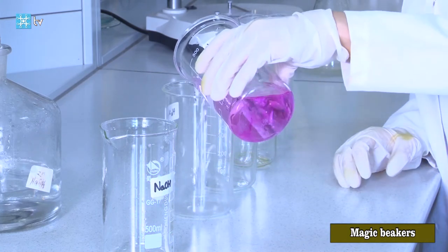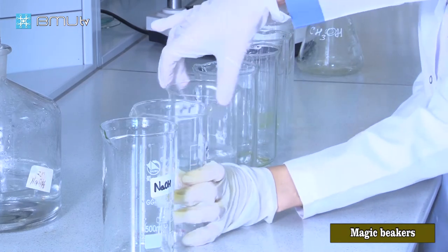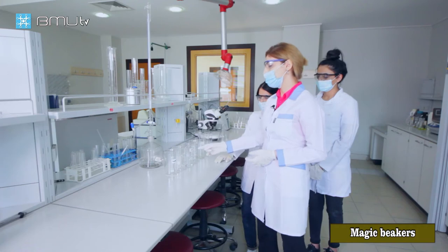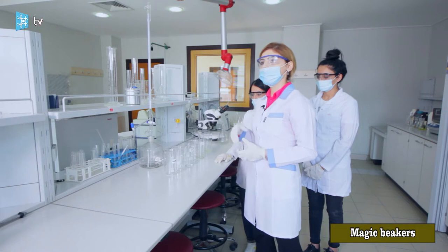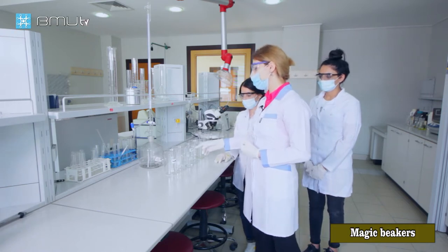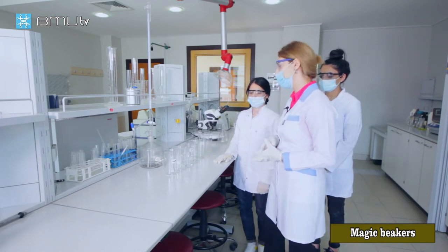Phenolphthalein and sodium hydroxide gives pink color. When we pour the solution to the third beaker, we will get a colorless solution. Because sodium hydroxide will react with sulfuric acid and the result will be salt and water. In the neutral solution, phenolphthalein cannot give pink color.